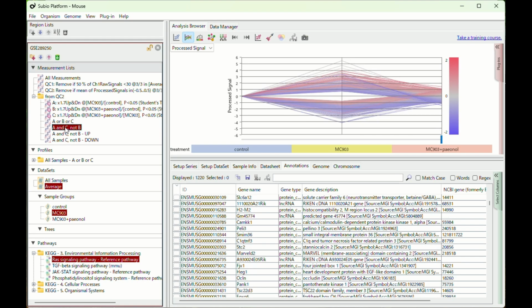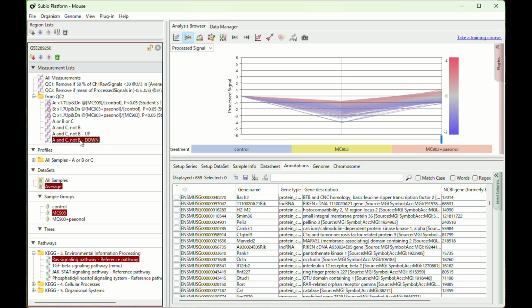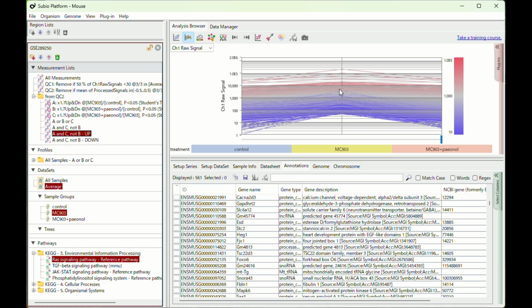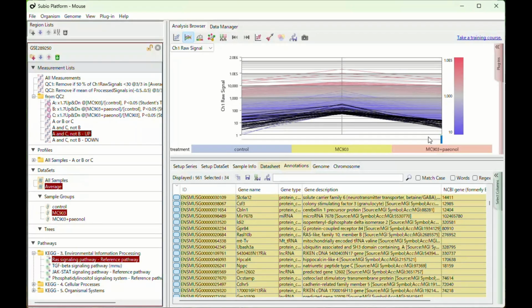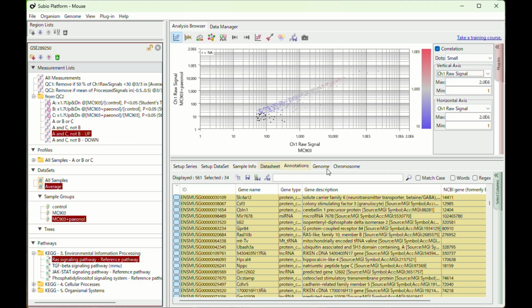There are lists of differentially expressed genes. You can not only view the table, but also do more with the Subio platform. For example, you can separate genes that show the common expression patterns by their expression levels. Some genes are highly expressed, and others are moderately expressed. Interestingly, some genes are almost not expressed when it is added. Comparing gene counts may tell you more than fold differences because they might behave like on/off.